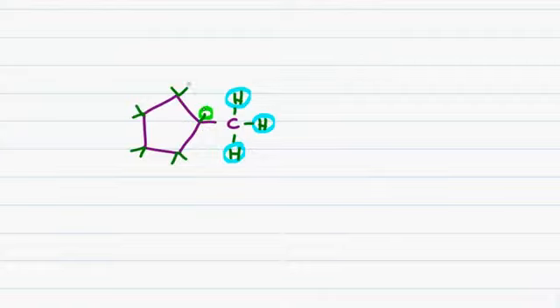Next to that I have two hydrogens on a secondary carbon, however since this is symmetrical, the two lower hydrogens on the secondary carbon are also equivalent. If I move further to the left, it appears that the two hydrogens circled in blue, both top and bottom should be the same as the ones I circled in yellow, however the blue hydrogens have two hydrogen neighbors on each side while the yellow hydrogens have two neighbors on one side but only one neighbor on the other side, this makes them different. And so in the molecule methyl cyclopentane, I have a total of four types of hydrogens as far as NMR is concerned.